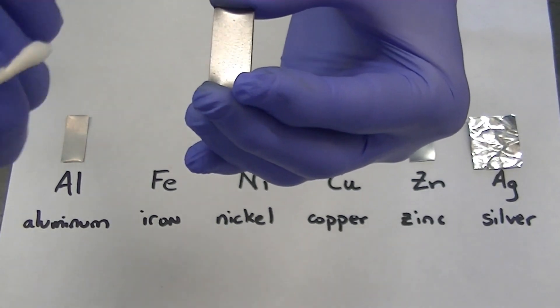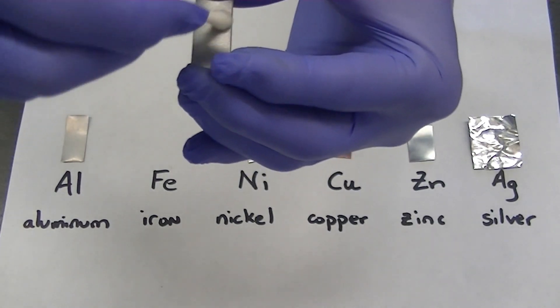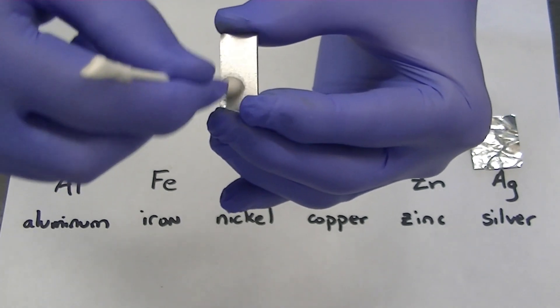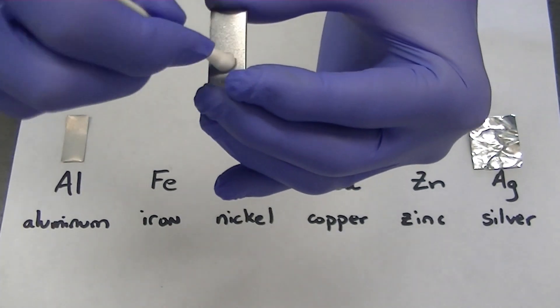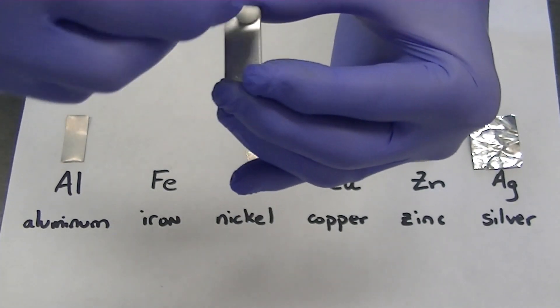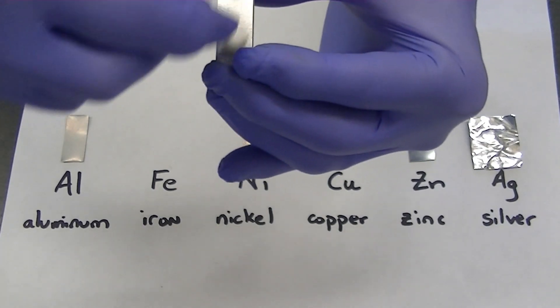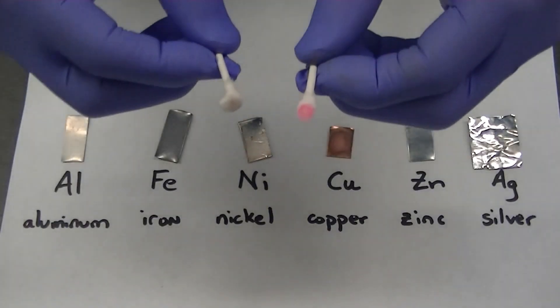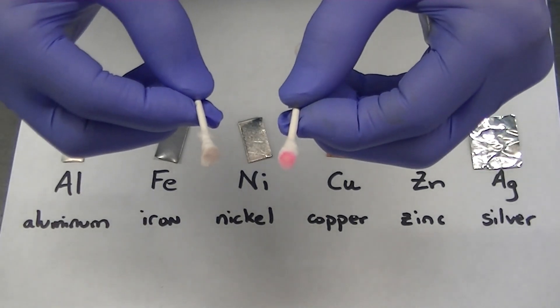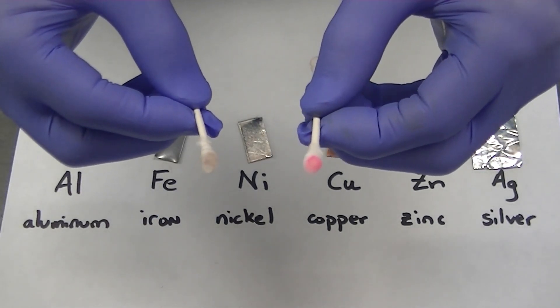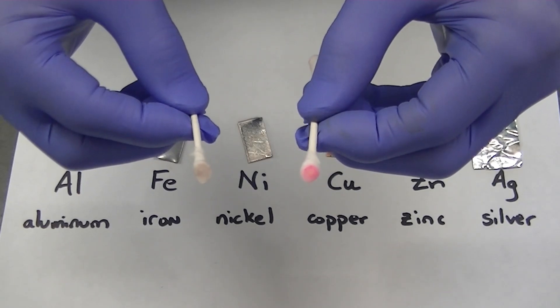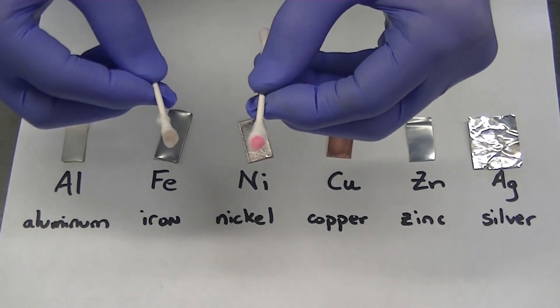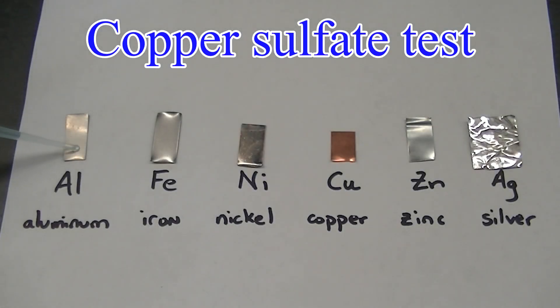A slight red or pink color in this test indicates the presence of nickel. Use caution when applying the DMG test to samples of iron — iron ions will react with dimethylglyoxime to form a complex, but it is not nearly as vibrantly colored as the nickel-DMG complex. Here you can see a comparison between the DMG complex formed with iron on the left and the DMG complex formed with nickel on the right.